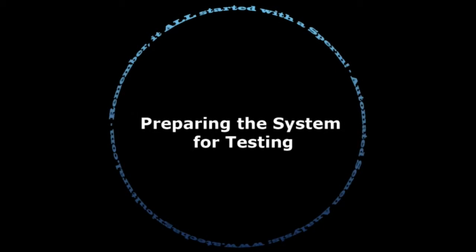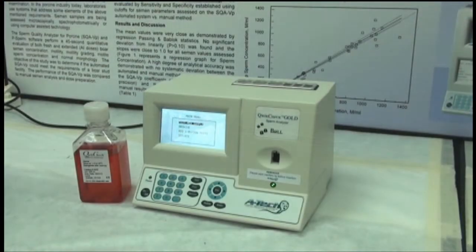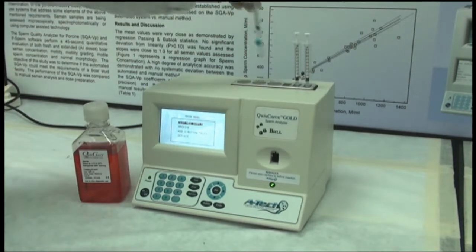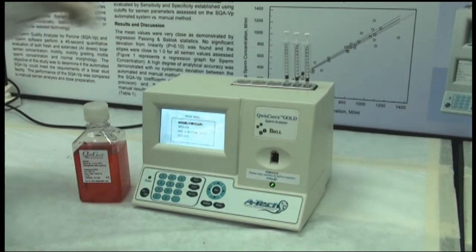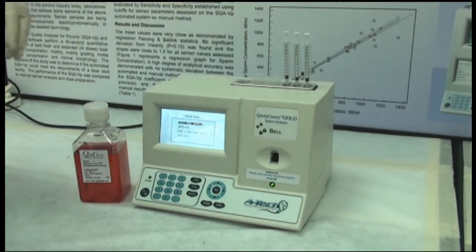Your QwikCheck Gold system comes with an onboard heating dock used to ready your testing supplies. Load the testing capillaries one at a time, with the blue stoppers facing forward. If loaded backwards, they will not reach proper temperature, and the sample may be cold shocked upon aspiration. Now place your dilution cups into the heating dock, and prepare to fill them with your sample diluent.